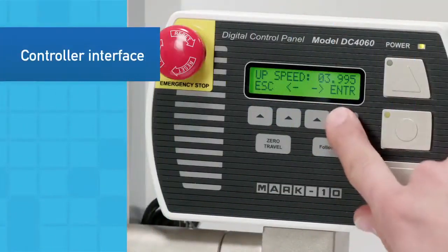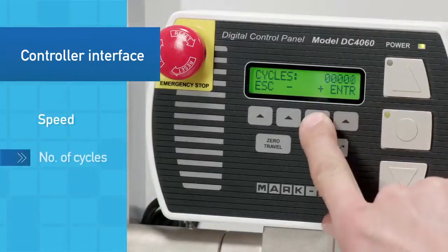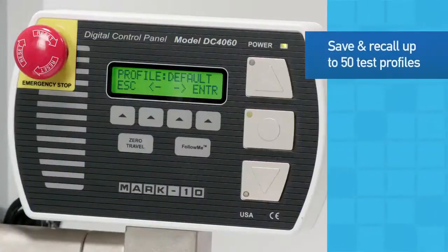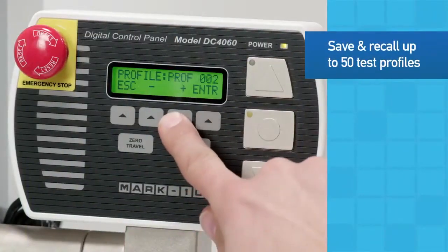Utilizing the simple control panel interface, set up test parameters such as speed, number of cycles, and other settings. Save and recall up to 50 test profiles to accommodate a variety of test methods.